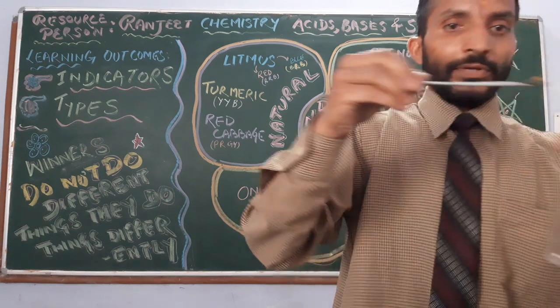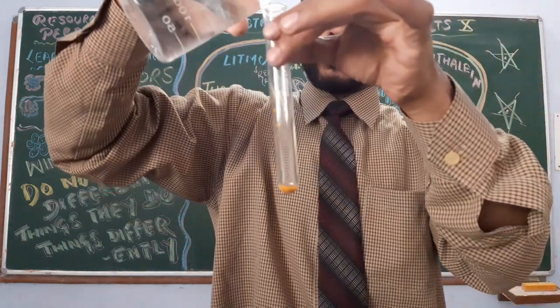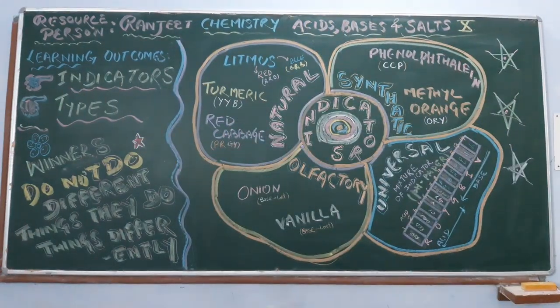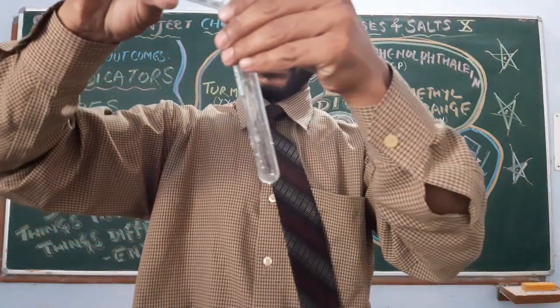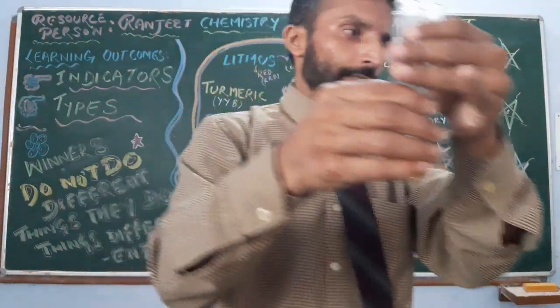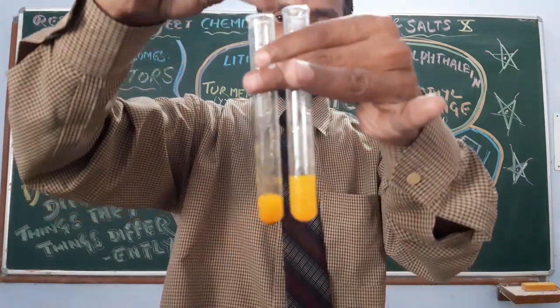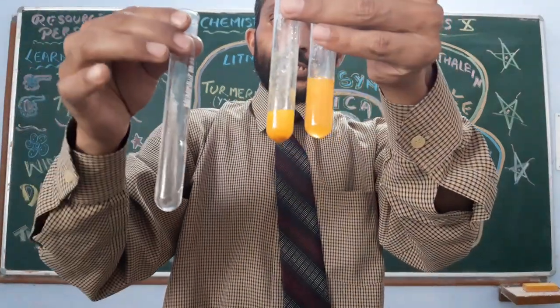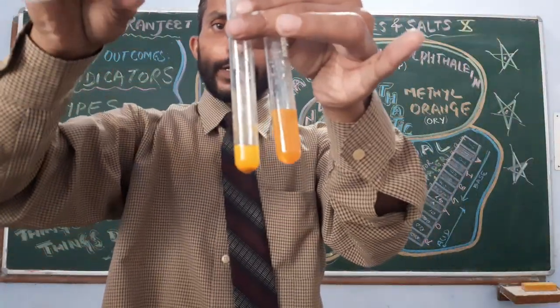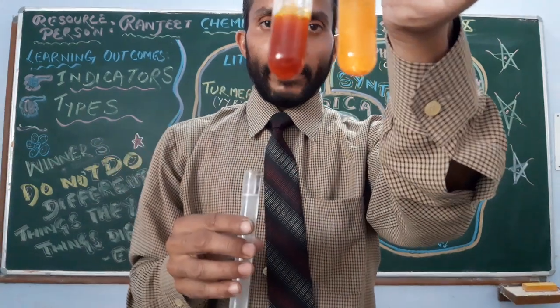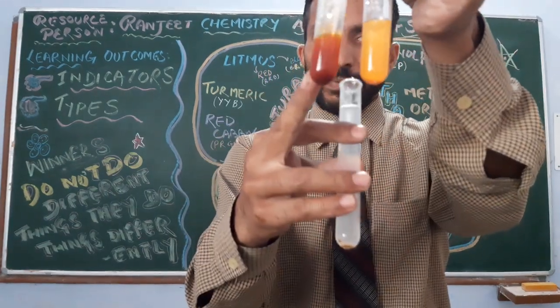I am having turmeric — yellow colour. I will dissolve it in water. It is yellow. I divide it into two parts to see the change. In acid — no change; I have added acid and there is no change. Now I will add base — wow, it becomes brown, reddish brown. In acid: yellow; in base: brown.